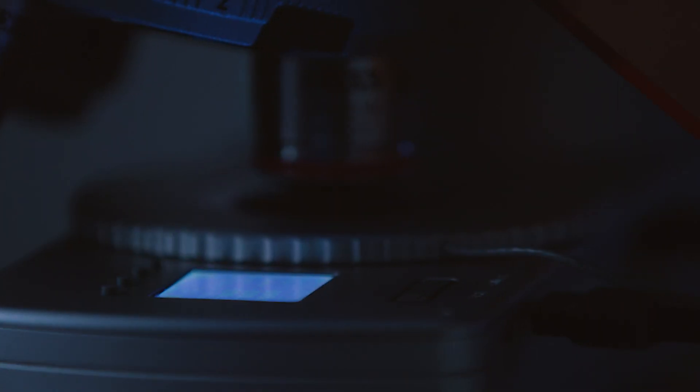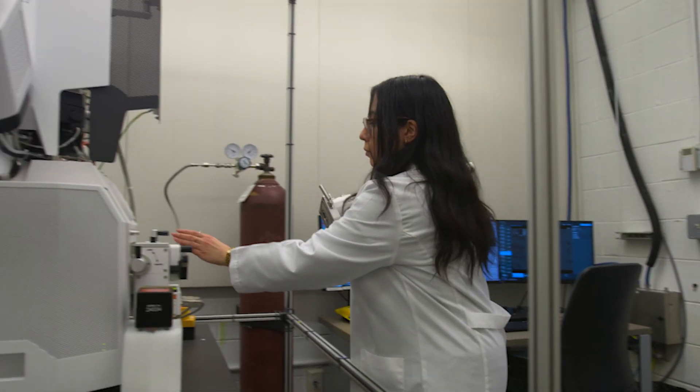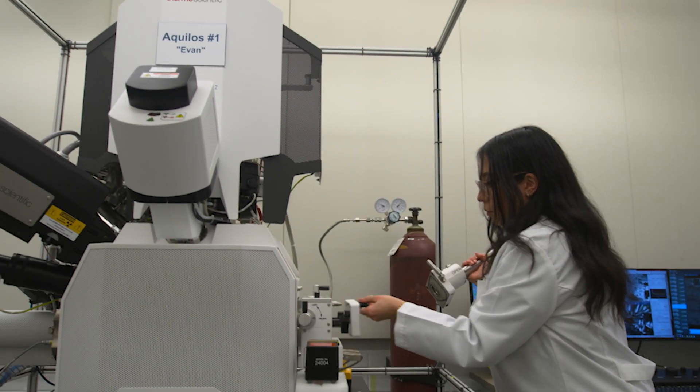The Simons Electron Microscopy Center is a leader in the field of biophysics and biotechnology. The mission of the center is to build a community of researchers to use cryo-EM techniques to uncover molecular and cellular structures. We are equipped with over 14 cryo-electron microscopes between high-end cryo-transmission electron microscopes and focused ion beam microscopes.